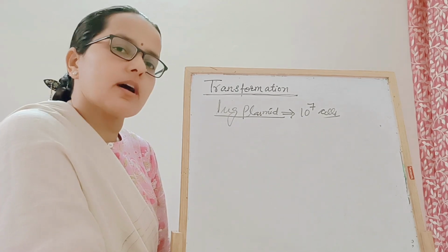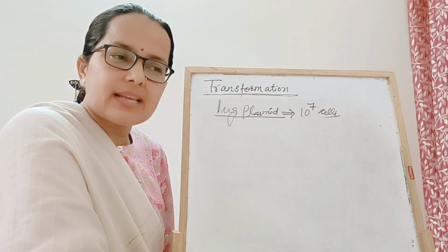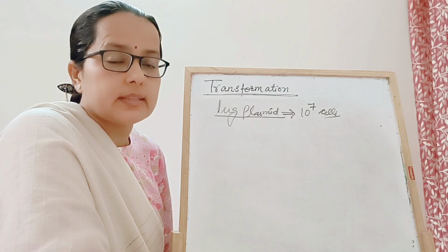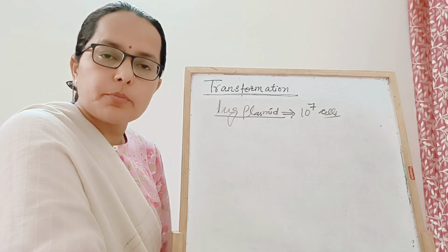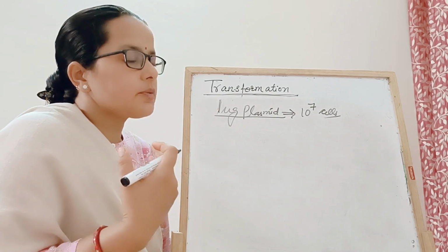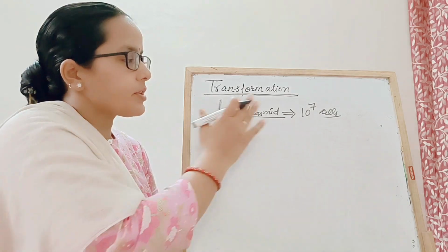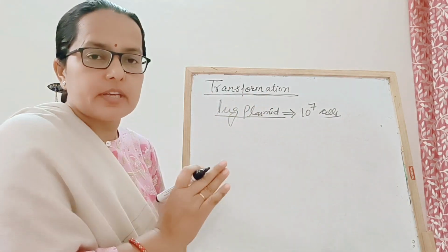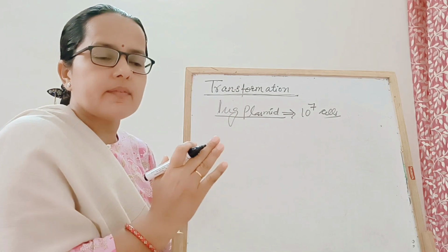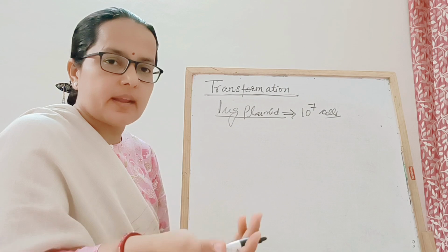That is affected by the type of competent cell methodology, meaning your cells are good enough to take the DNA, and the second is the transformation method. If you have not proceeded with the cells or transformation in a scientific manner, then your transformation efficiency will be affected. So for transformation, there are some important things you should prepare in advance.